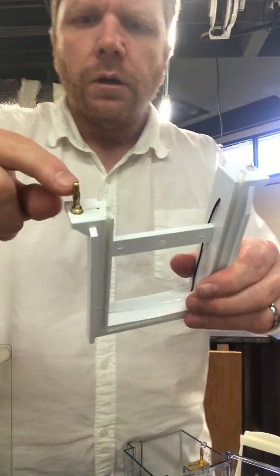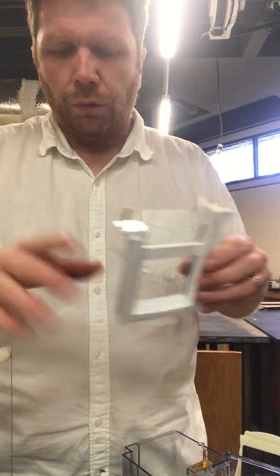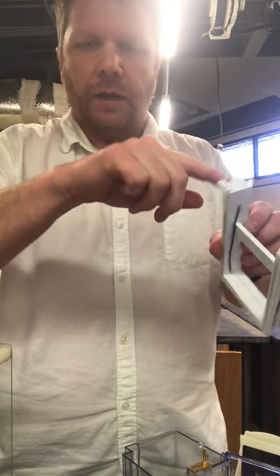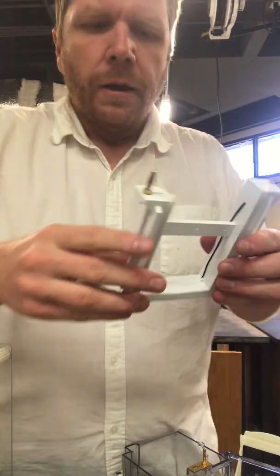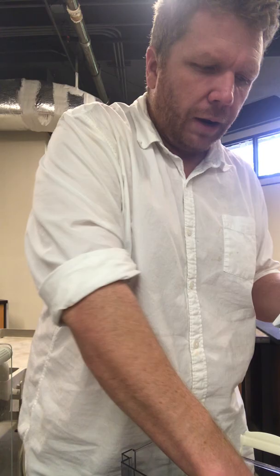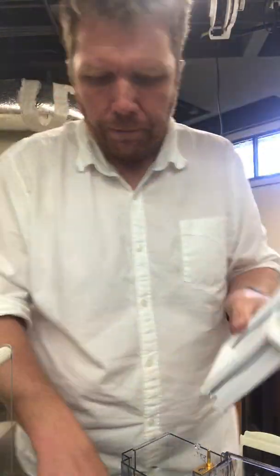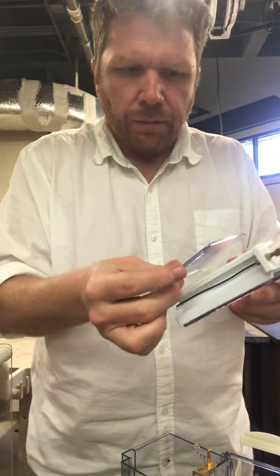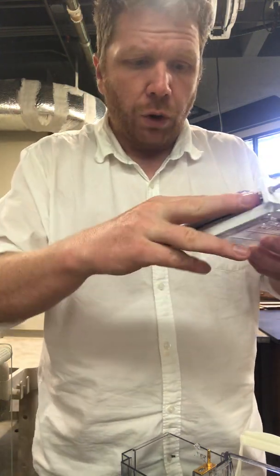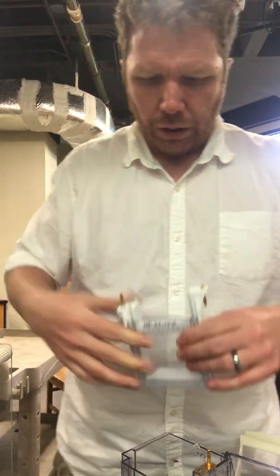So what I'm gonna do is get this white piece of plastic that has a couple of electrodes in it so that I can send an electric current through. In addition to that, it has these plastic seals, these gaskets. I'm going to put my gel on this side. The other side, I'm going to use this buffer dam to more or less close it off. So I've created this little sandwich right here.